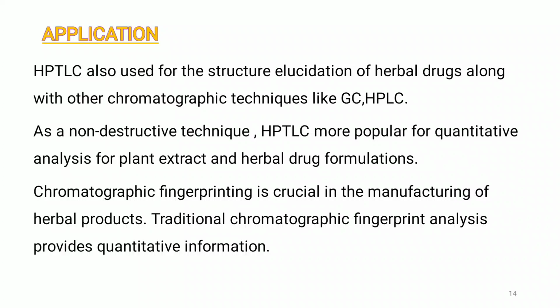HPTLC-MS, HPTLC-FTIR, and HPTLC scanning diode laser have made HPTLC a powerful analytical tool in the field of analysis. It is noteworthy that utilization of instrumental HPTLC towards the analysis of drug formulations, bulk drugs, natural products, clinical samples, foodstuffs, environmental and other relevant samples will increase in the future.